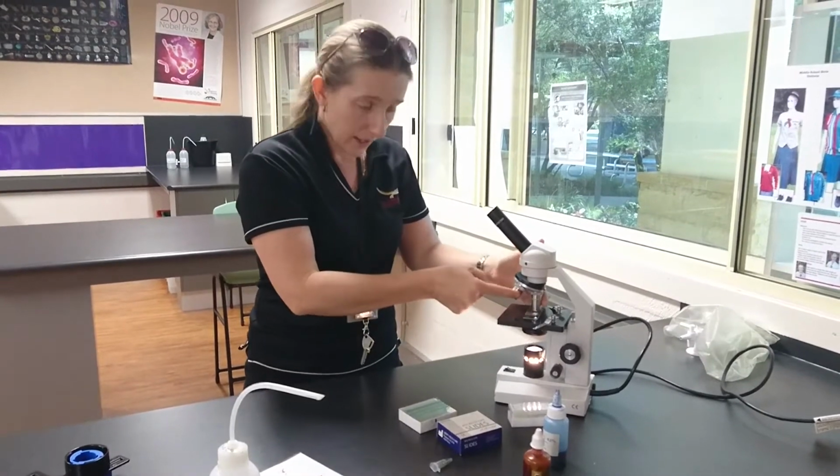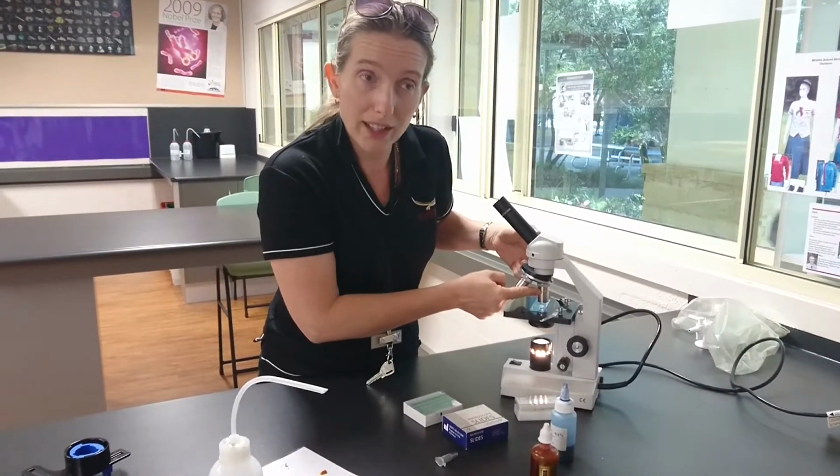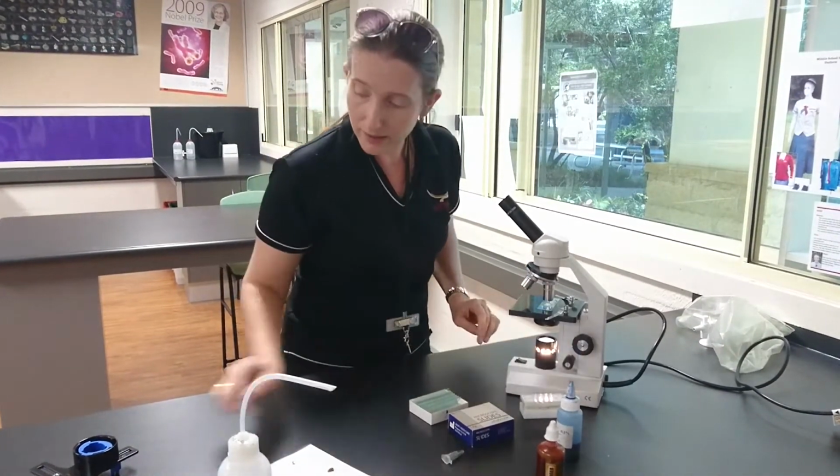Now, the biggest setting you're going to be using is the yellow one. All of the photos will be taken on the yellow setting, nothing else. So get it in there and focus it.